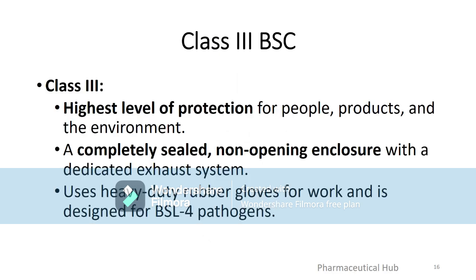Slide 16, Class III. Highest level of protection for people, products, and the environment. A completely sealed, non-opening enclosure with a dedicated exhaust system. Uses heavy-duty rubber gloves for work and is designed for BSL-4 pathogens.